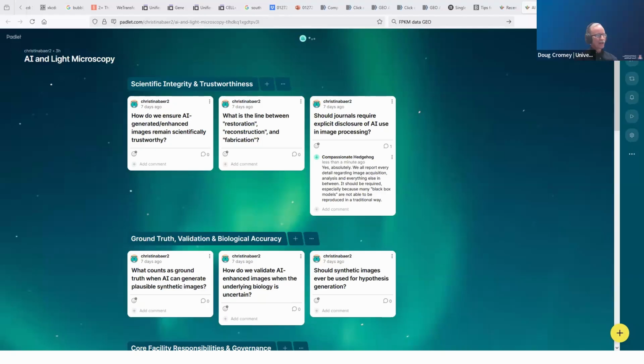Yeah. Well, and maybe, at least for the commercial instruments, this is something we may need to press our vendor partners on and say, is there a way? Andy's mentioned in the chat about blockchain. Maybe there is some way we can create that chain of custody so that yes, it's in a proprietary file format, but it's also got some other sort of validation, encrypted or otherwise, in it that again may just buy us time in the long run, but we've got to do something.